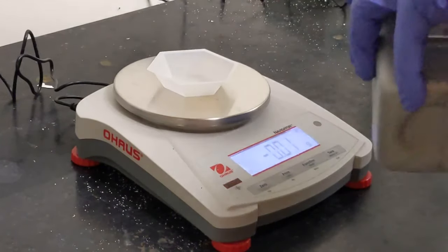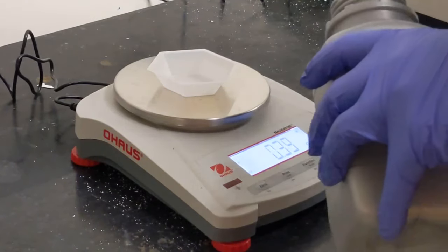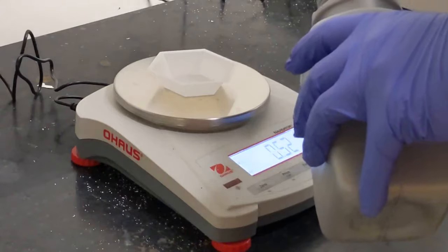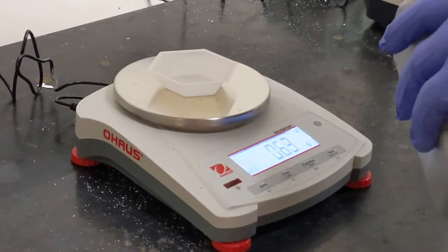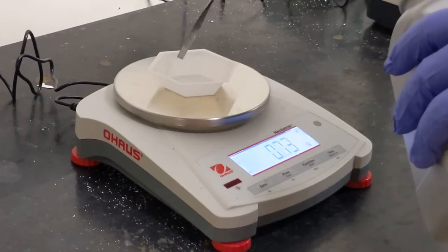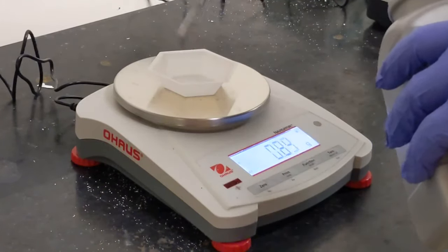Then we add our solid to the weigh boat and continue to add solid until we have the amount we need. As we do this we can see the balance changing. Once we reach the desired amount of solid that's been weighed out, we can record that mass in our lab notebook.